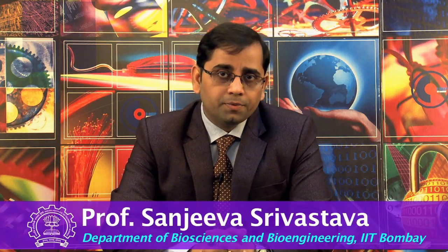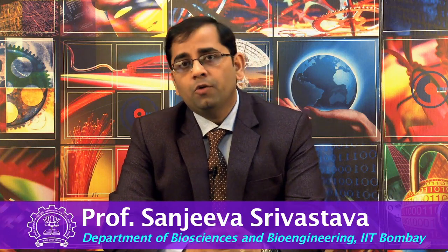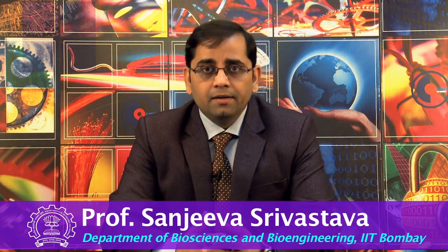I hope you got a better understanding of this label-free biosensor, Bio-Layer Interferometry technology, BLI. The next lecture will include a demonstration session that was conducted during this workshop. I'm sure you will now be able to understand these concepts much better, and you will also understand how to perform these experiments for your biological samples of interest, for your biological problems of interest. Thank you.